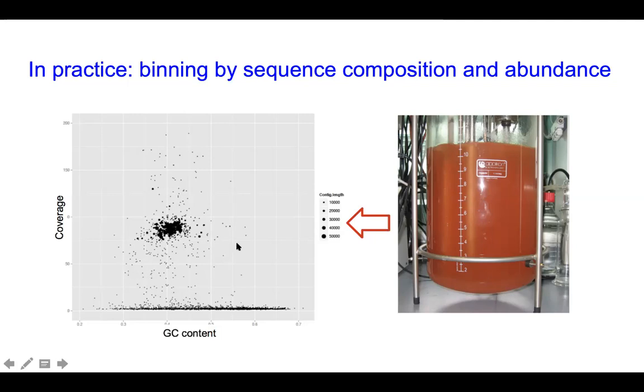What you also see is that there's this halo or cloud of contigs around this.